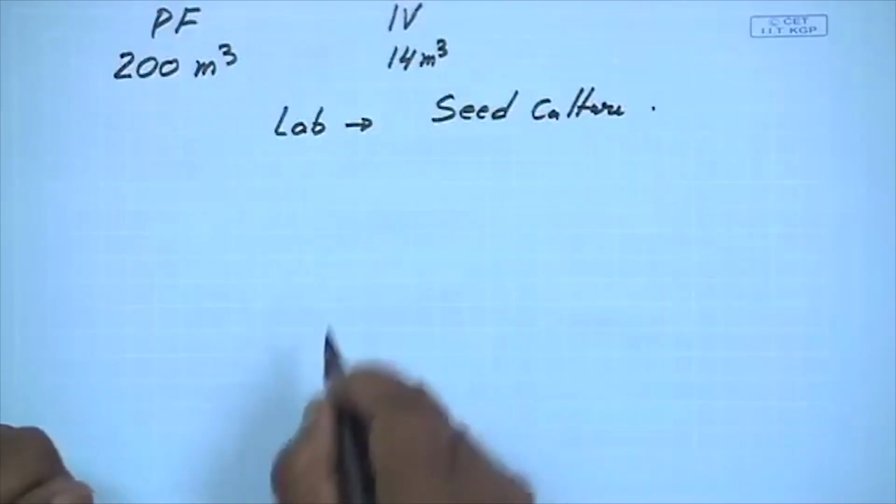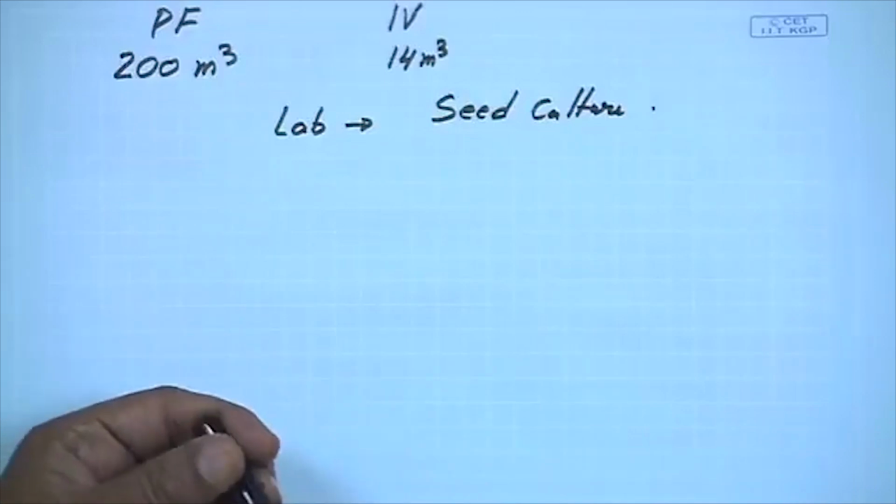Through our research and developmental work, we determine the optimum concentration of cells required for the preparation of the media. Once we have this value, I can give a very typical example: in a bacterial fermentation process, particularly for unicellular cells, we don't have any problem, because you can count the number of cells under the microscope with a hemocytometer, and so find the concentration of cells.